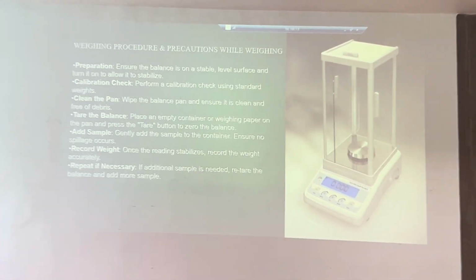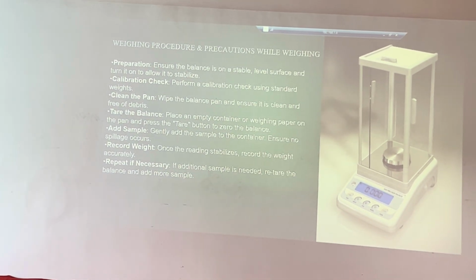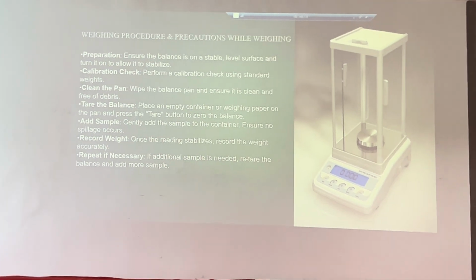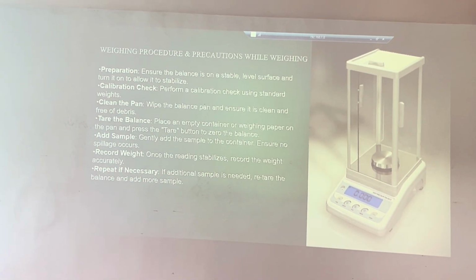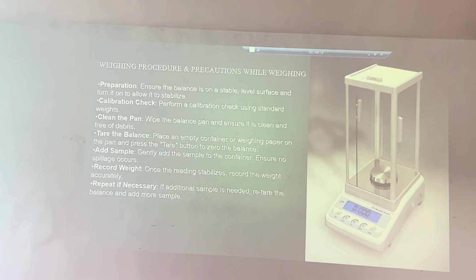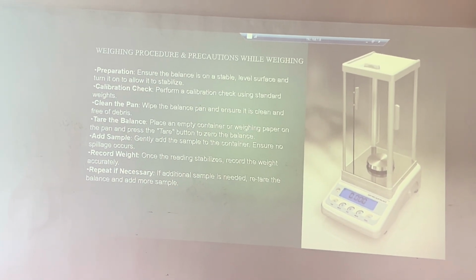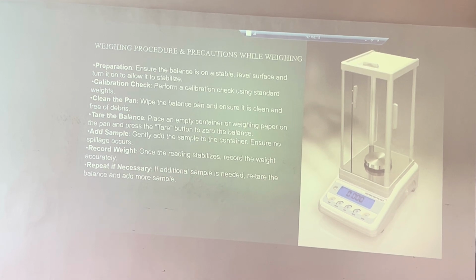And fourth, before taking the weight, everyone takes the balance very seriously because they don't want to cross-contaminate their product, and everyone keeps it clean and neat. But after taking the weight, I have seen in most cases they pour something. For example, he is doing atorvastatin, I am doing paracetamol. If it is not cleaned properly, then if someone is doing the RS test, they may get cross contamination. So there is a possibility. So always use the brush to clean the balance surface. Next.